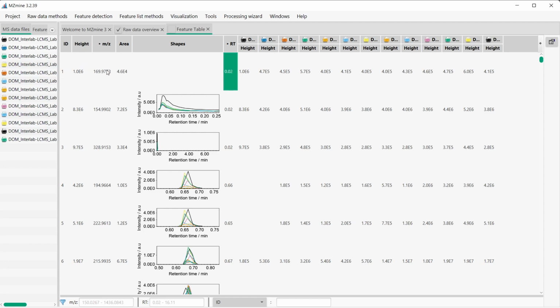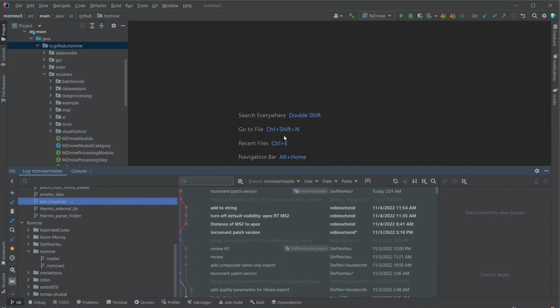So if we start from here, in this short video, we're going to create two new columns in the table for the rows, assessing the quality of spectra based on spectral entropy, which is one measure people use to look at the spectra and the chaos in spectra. So how can we do this?